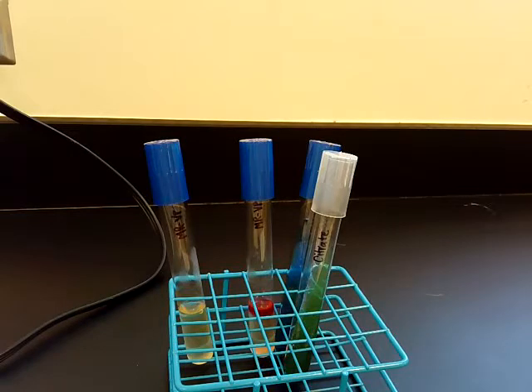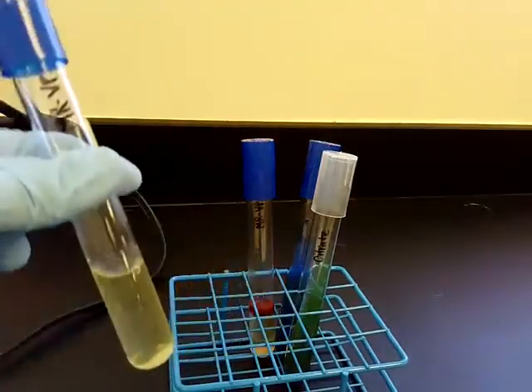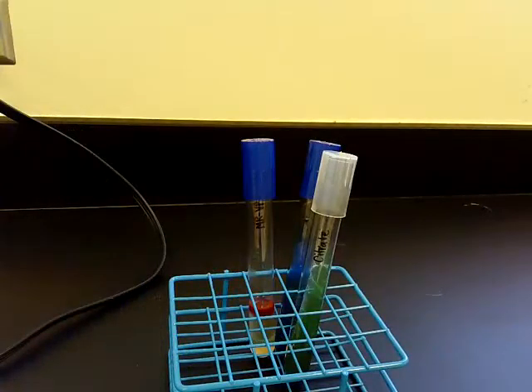Alright, so now I'm going to go over the results of some of these tests. So we already got the results for the indole test, and now I'm going to talk about the methyl red, the MR test. So for the MR test, we inoculated our MRVP broth. It looks like there's some growth in the tube. And now we're going to add methyl red drops to see if it's a mixed acid fermenter.